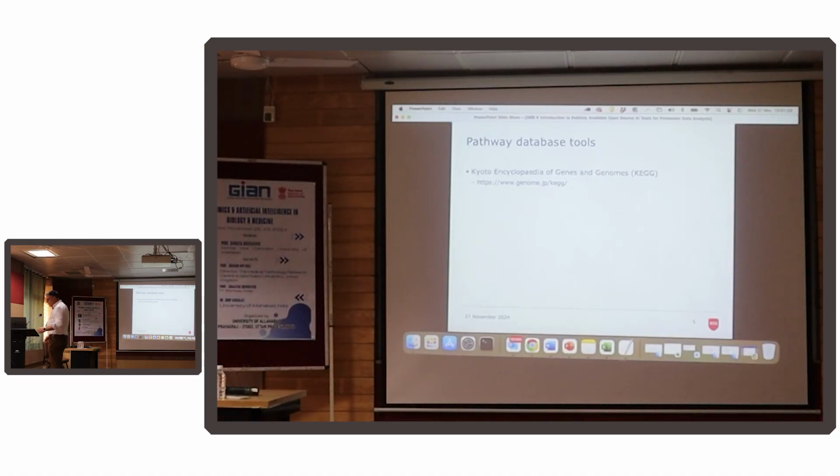So one pathway database is KEGG, which is the Kyoto Encyclopedia of Genes and Genomes. We can literally drop the gene symbols into that. It'll tell us what pathways are coming up. More powerful still is a piece of software called Reactome that looks across multiple pathways and has a very rich set of features in it. So Reactome is very powerful. We can also, if you have money, do Ingenuity, but you can use free trials. You can get a free trial.